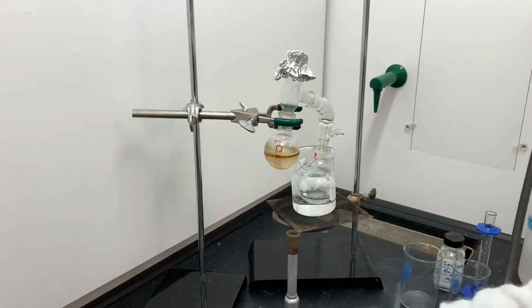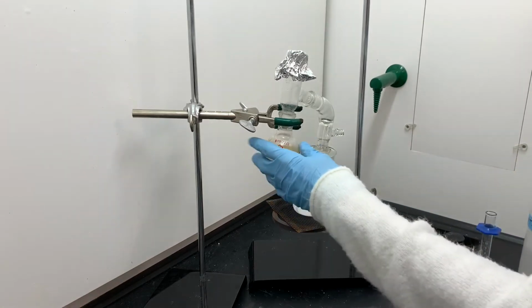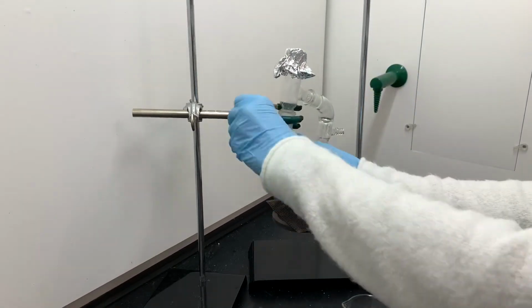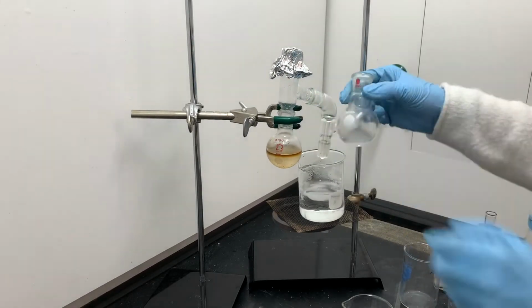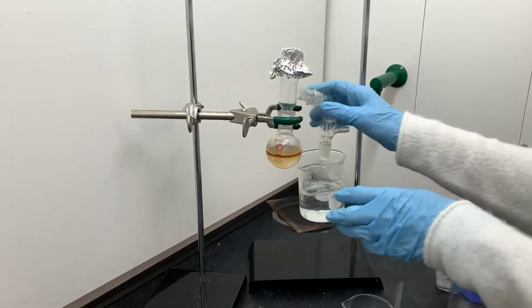So this has been reacting for about an hour and a half, maybe 2 hours. There's a small amount of product inside that receiving flask. It's really hard to see the product in the receiving flask, not just on video, but also in person, because it's a colorless liquid that's inside a flask that's inside a beaker full of water, which is also a colorless liquid. But as I pull it out and set it aside, you can see there's a little bit of hazy liquid inside the bottom of that flask. That's our product.